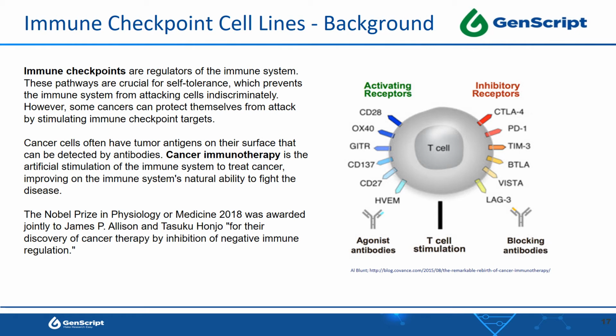As you can see in the image on the right side, there are activating receptors including CD28, OX40, GITR, CD137, CD27, and HVEM to activate the T cells.